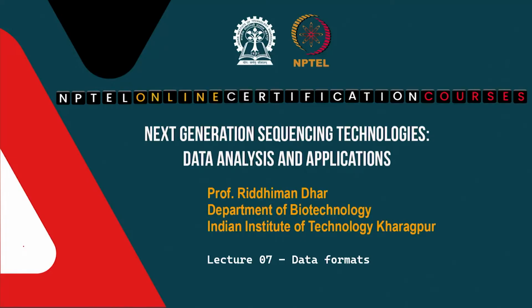So if you are planning to do next generation sequencing experiments yourselves, you will know what the parameters and aspects are that you need to look at. In today's class, we will be focusing on data formats. Okay. So, you have designed your experiment and you have sent your sample for sequencing. You get the data back from the sequencer. So, how would you interpret the data? How would the data look like, right?